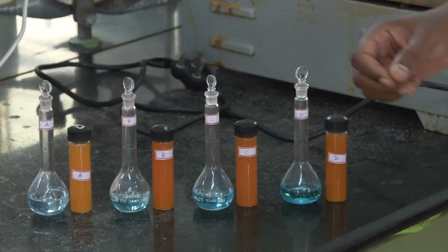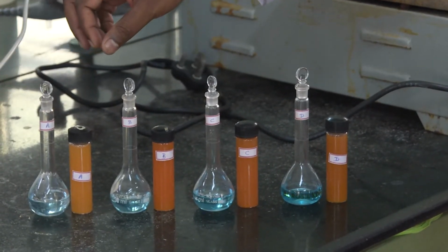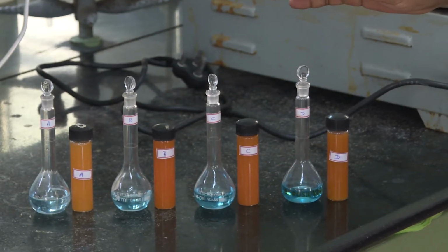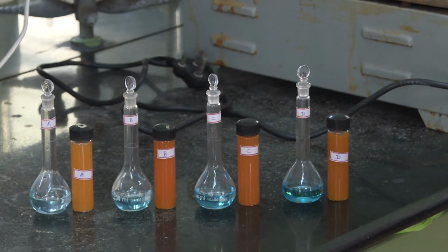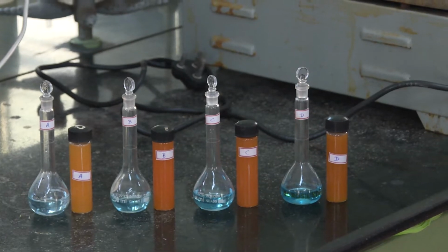Okay, students, this is the second part of the experiment. This is the color observation that you have. You can see they are all almost the same color. That's because we have used 0.01 concentration of sodium hydroxide. Now our next task is to measure the turbidity of this solution.